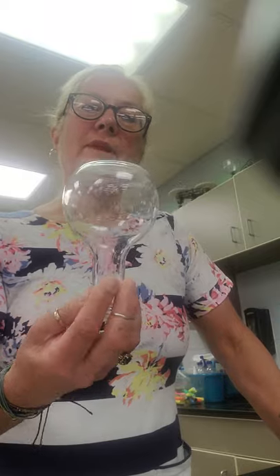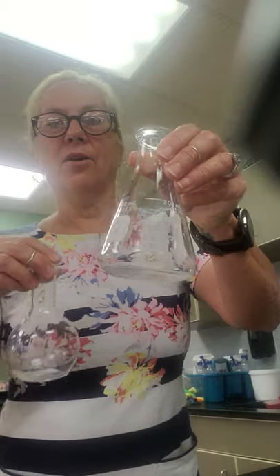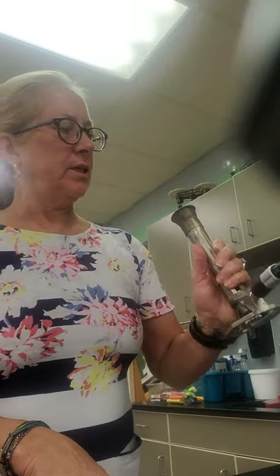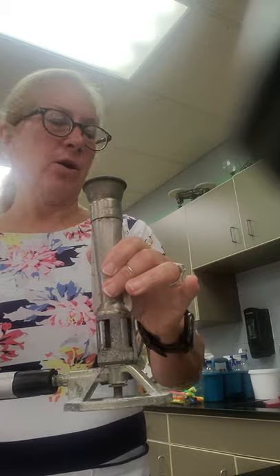Number seven: the other flask is the Florence flask. I always remember this because Florence is a girl's name and Florence is curvy — Earl is not. Earl, Florence. Florence is used for boiling.